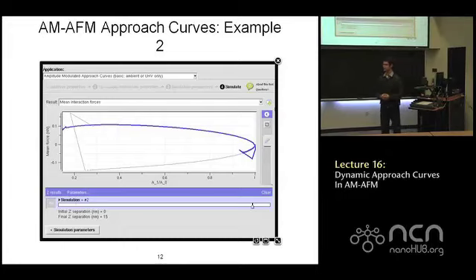So address one other thing. When we plot these things versus amplitude ratio, what happens is when we're transitioning from one branch to another, there are transients. So when we plot these curves, you'll see a stray point here and there, and that has to do with the fact that we're simulating versus the Z approach. We're monitoring amplitude, and as we jump from one branch to another, the cantilever is transitioning between those branches.